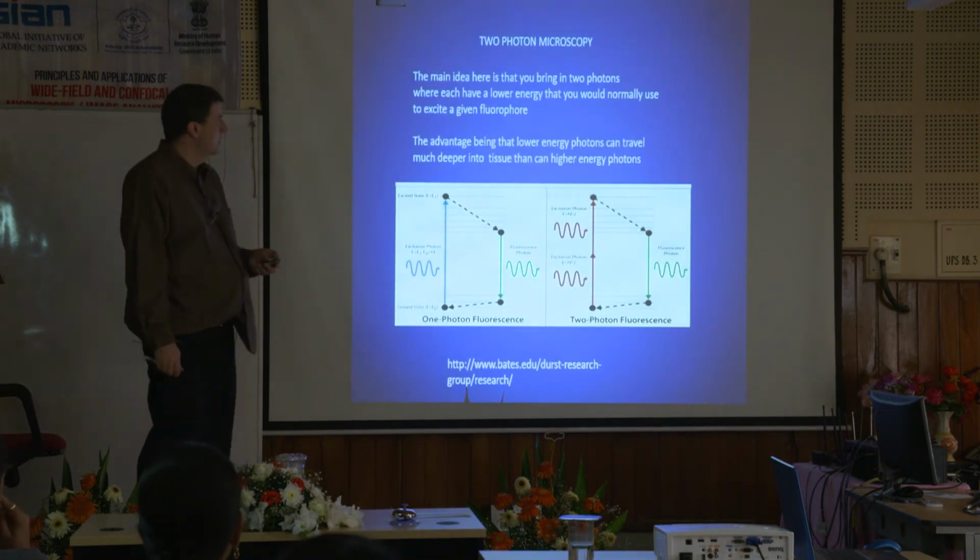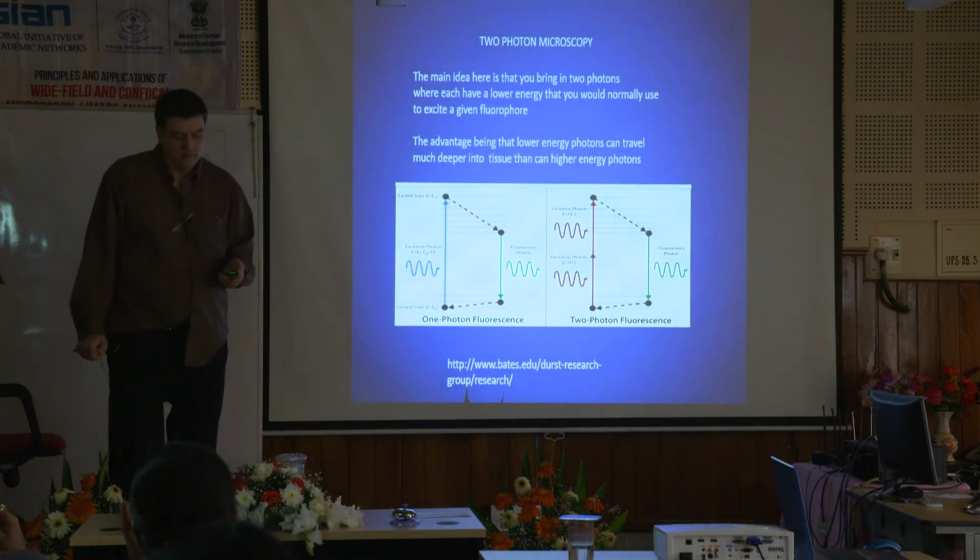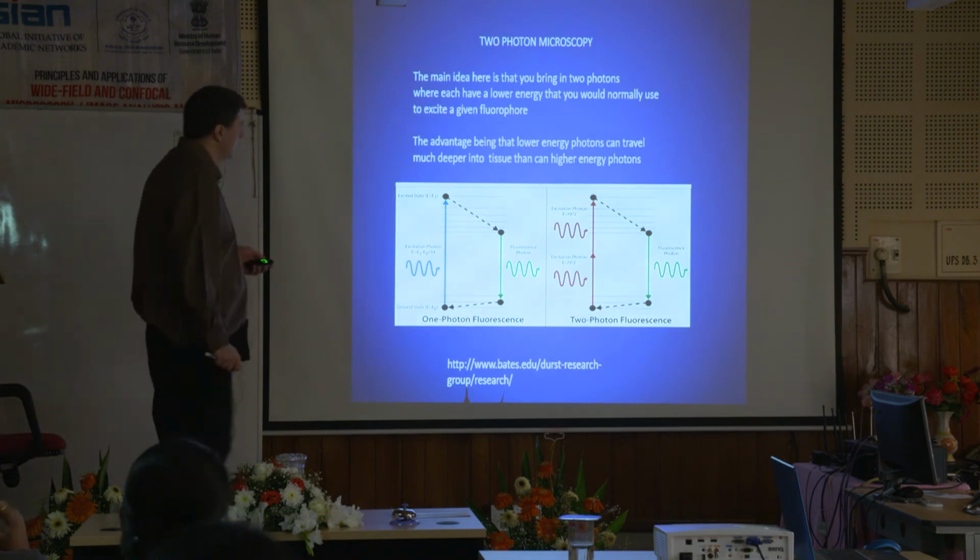Okay, so 2-photon microscopy, okay? 2-photon microscopy.